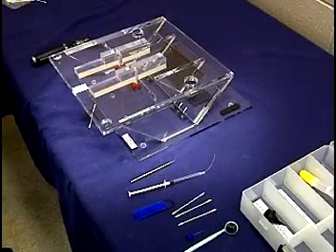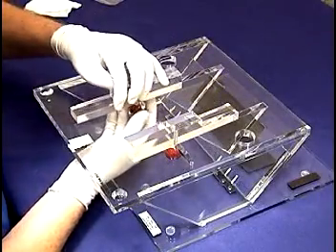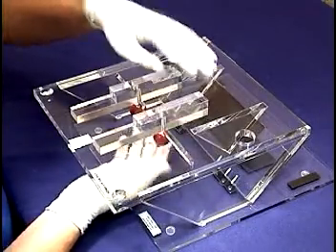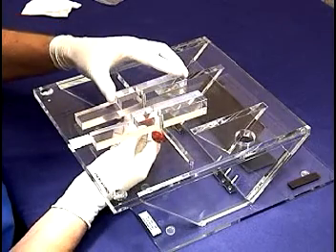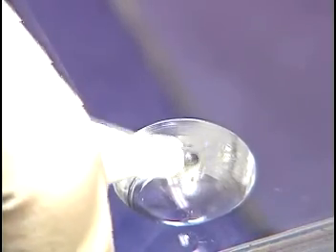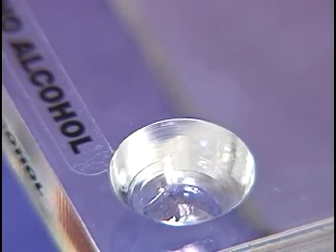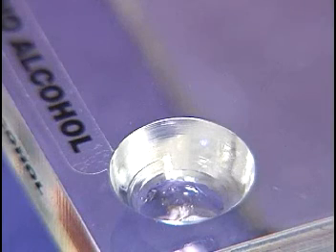Before intubation is started, it is important to have everything prepared and in place. First, the work stand is configured for the mouse. The body positioners are rotated so that the shallow, stepped ends face the operator. Lidocaine jelly is used to provide local anesthesia to the cords and is placed in one of the small wells at the front of the stand. It is not supplied with the stand because Hallowell EMC does not have a pharmacy license.